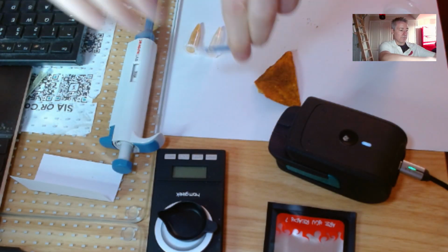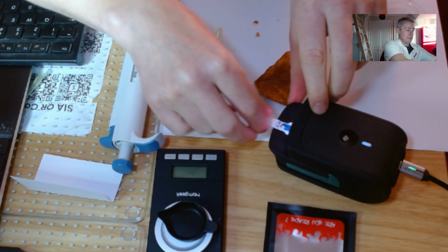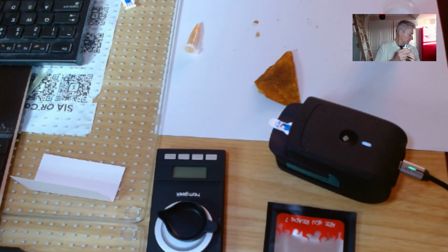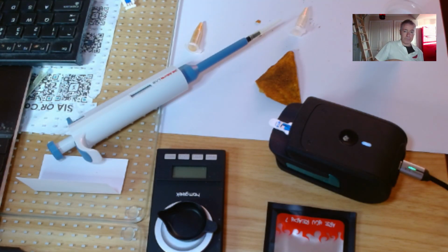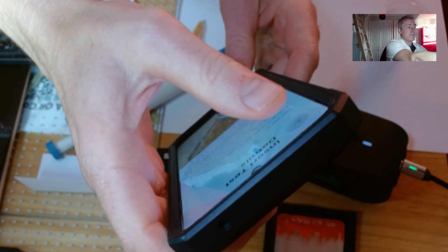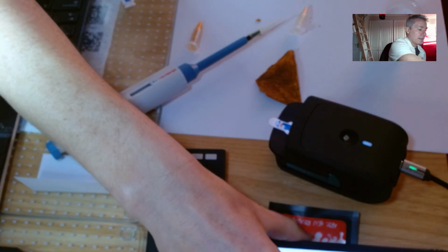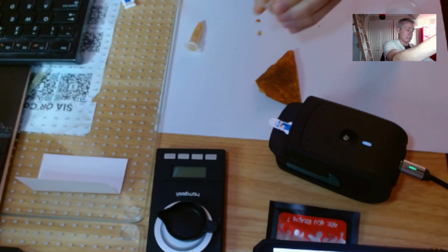What I'll do now is put in a new chili sensor. This is the Food Sense Duration 4. I have a sensor here, and I'm going to take a sample of this and test it. First of all, I'll grab my phone. The Food Sense Duration 4 is in Bluetooth connection with my phone, so I can control it from my phone. I'll talk about how I prepared the sample secondly, but first I want to get a reading.